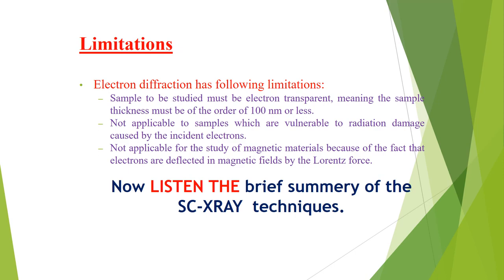An ordered substrate yields an ordered diffraction pattern, and a disordered substrate yields a disordered diffraction pattern. The result of single crystal X-ray diffraction is a highly ordered diffraction pattern, due to the highly ordered three-dimensional crystal structure, which makes the interpretation of the diffraction pattern more meaningful.